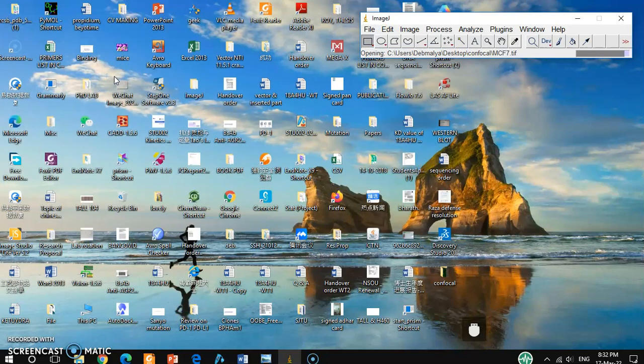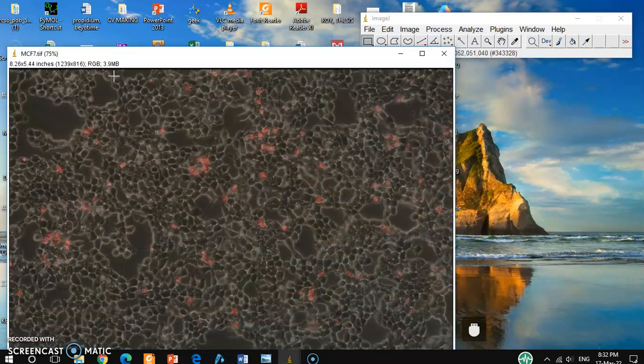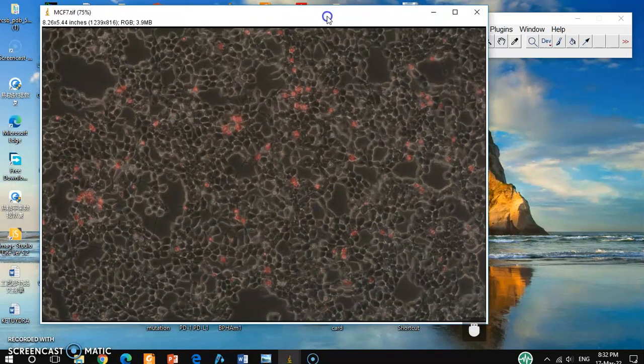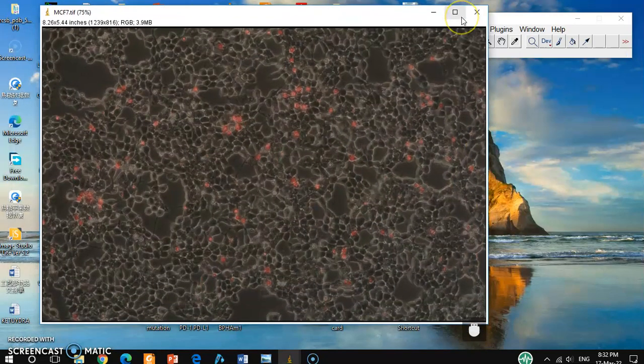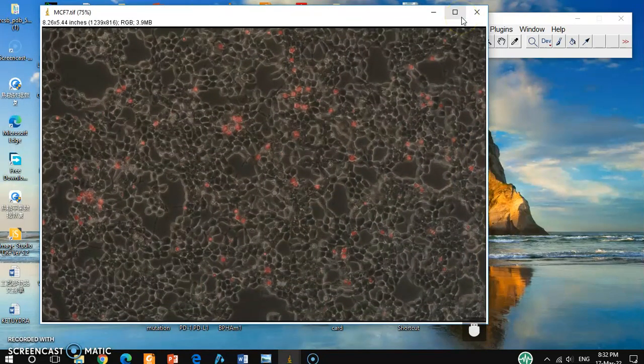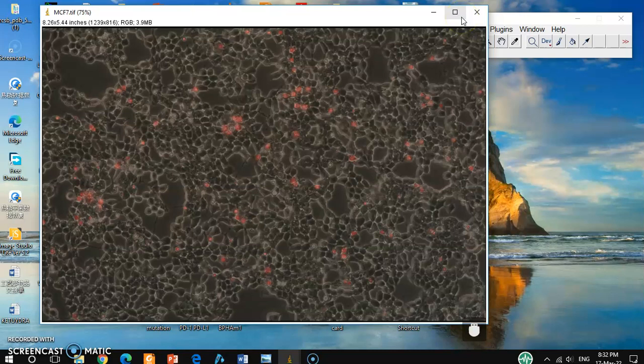So as you see, this is one of the Mars pictures where red cells and bright field pictures are merged together.